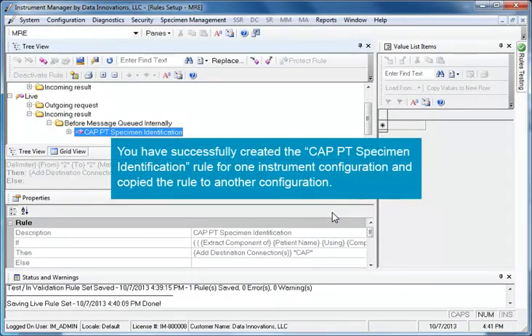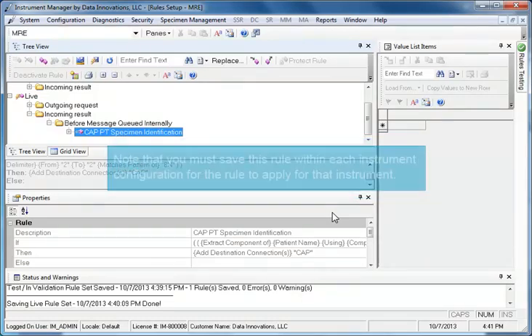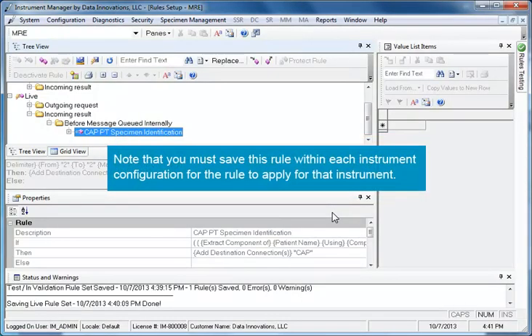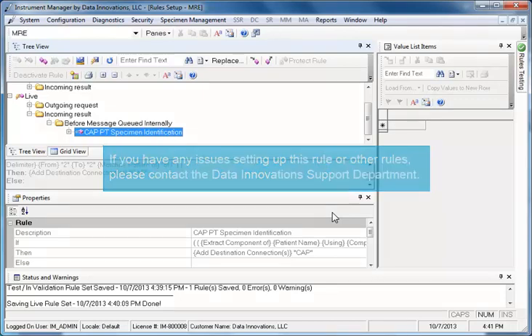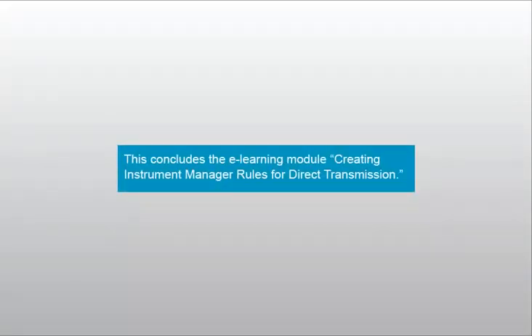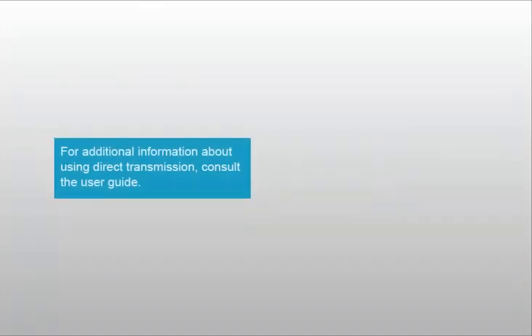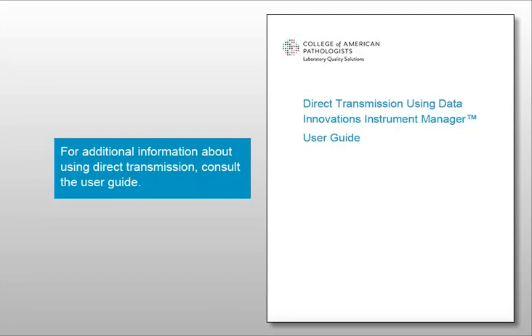And that's it! You have successfully created the CAP PT Specimen Identification Rule for one instrument configuration and copied the rule to another configuration. Note that you must save this rule within each instrument configuration for the rule to apply for that instrument. If you have any issues setting up this rule or other rules, please contact the Data Innovations Support Department. This concludes the eLearning module Creating Instrument Manager Rules for Direct Transmission. For additional information about using direct transmission, consult the User Guide.